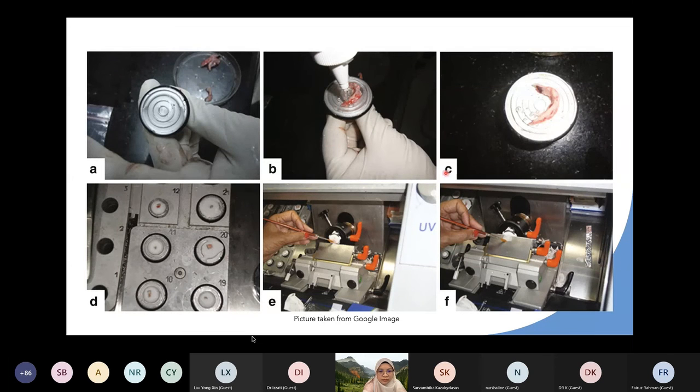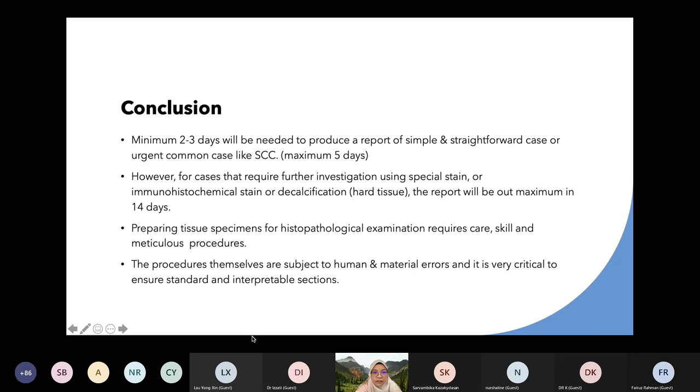Here we freeze the tissue and keep it frozen, and then section it and place it onto the microscope slides. Later we stain the slide with H&E. And all of these steps usually take about 5 to 10 minutes as compared to the routine paraffin wax embedded techniques that will require at least 2 days to complete.